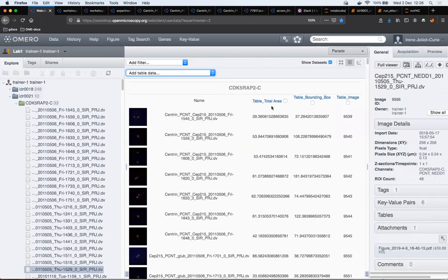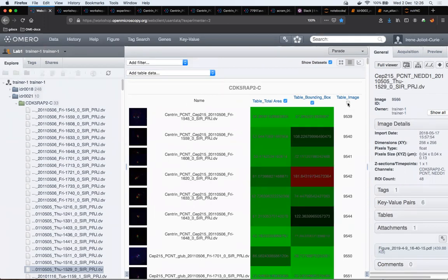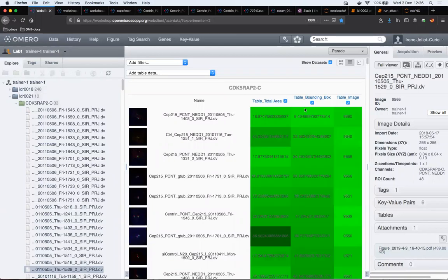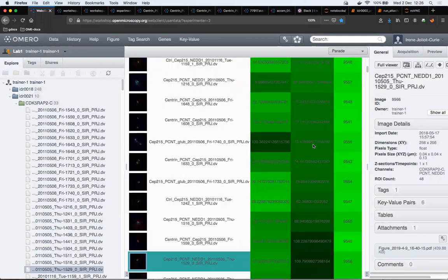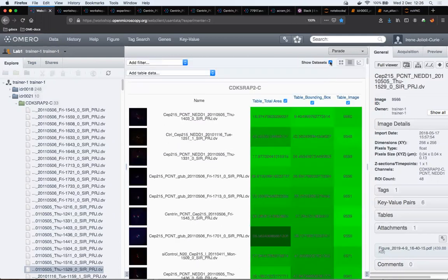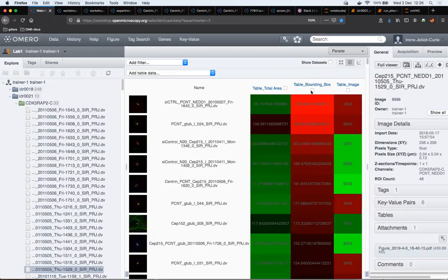Having these three columns, I can now check the checkbox, which will simply switch on the color coding on the rows, and I can do it for all three and sort the data according to the value in this column. And I can do it per data set, or I can do it for all. These images have simply no values in the CSV.